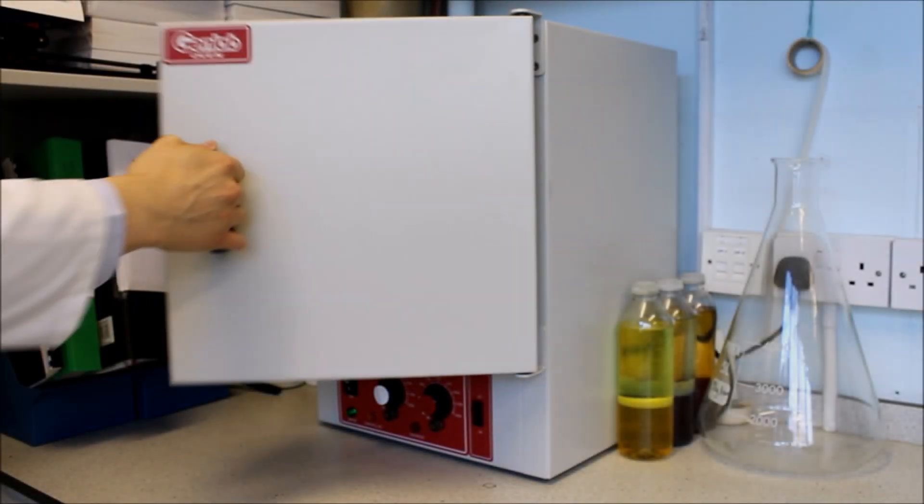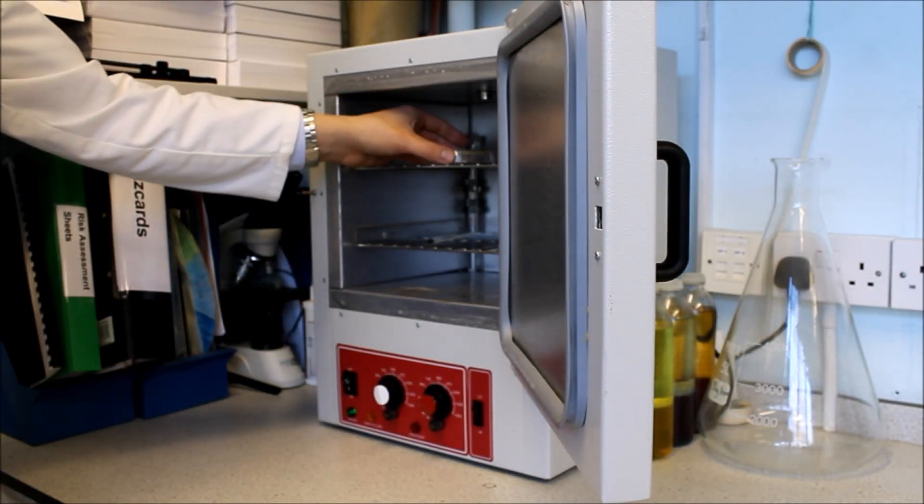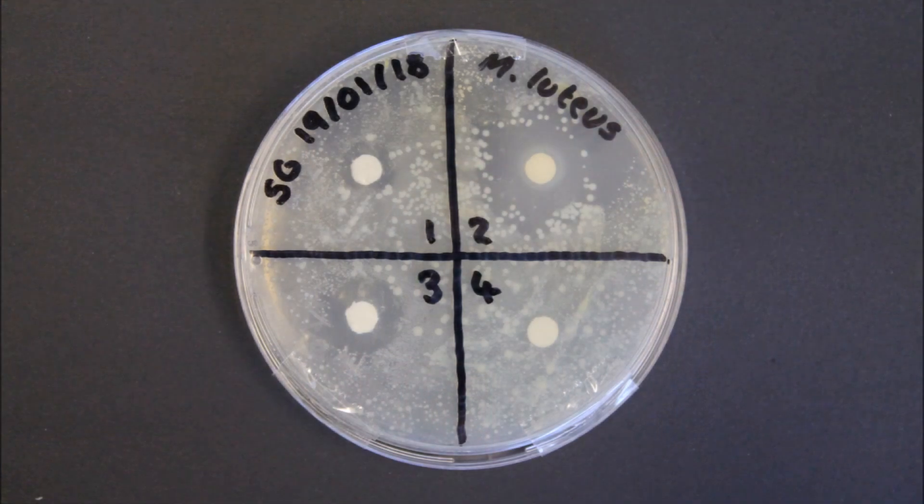Upon removing the agar plate from the incubator we can clearly see the zones of inhibition. Zones of inhibition are the areas around each antiseptic disc in which bacteria have not visibly grown.